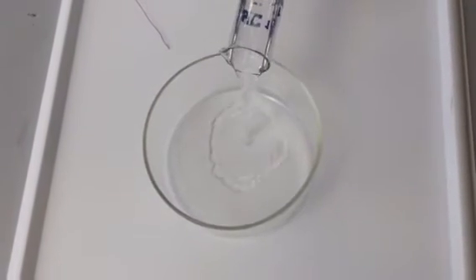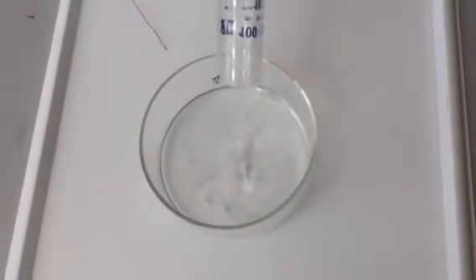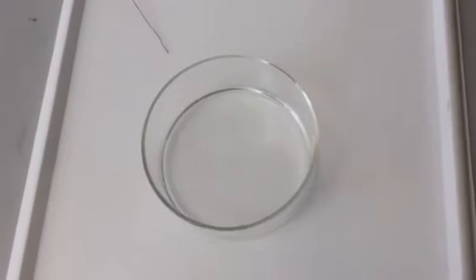We're going to put the sulfuric acid in — 6 mol of sulfuric acid — and then we're going to put the gallium.